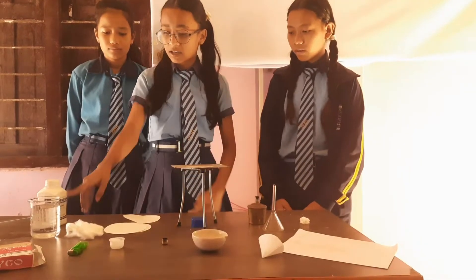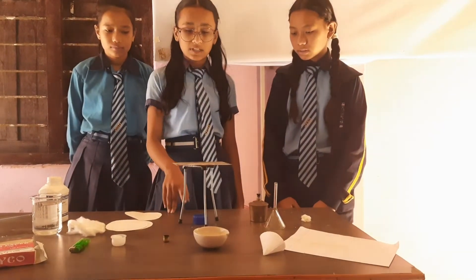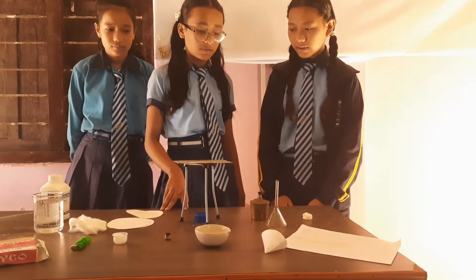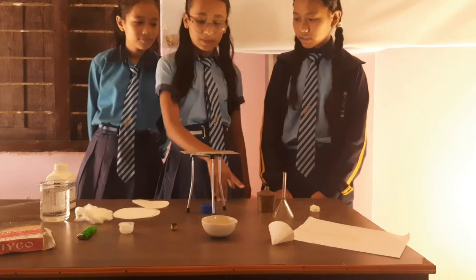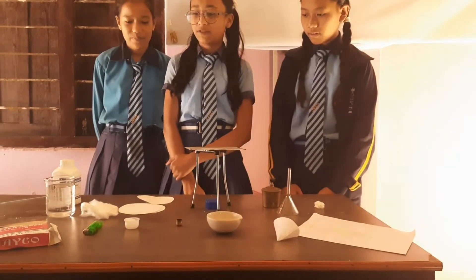The materials required are water with cotton, tripod stand, wire gauze, funnel, china disc, spirit lamp, camphor, etc.